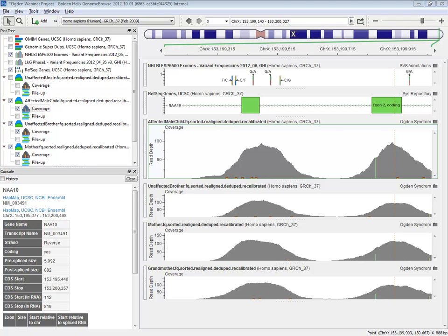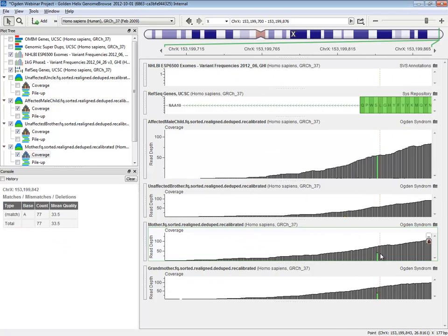The interesting and important thing to spend time with there is the fact that with cancer studies, you do not have these clean heterozygous variants that are called with perfect read distribution of half reference and half alternate. That's simply because you can't easily sequence a sample of a single cell, so you can't get a sample that contains pure cancer cells and no normal cells.